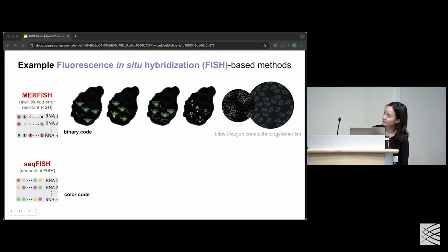So how does this look? So this is a cell, if you couldn't tell. And here are 5 different transcripts that are being imaged in this round. And so this is just at the first base position. Now we're going to image and figure out which fluorescent spots had a 1, so there was signal. And in the next round, perhaps this transcript now had a 0 in that spot.